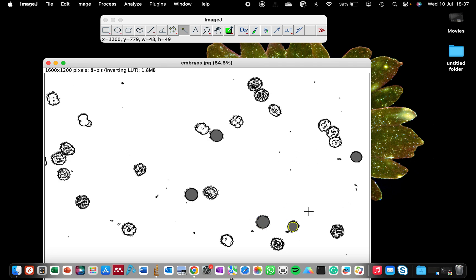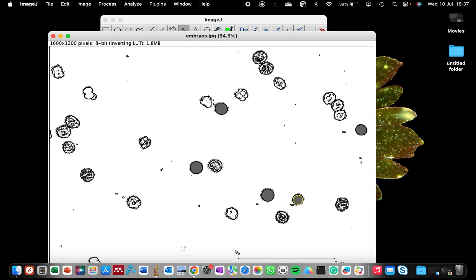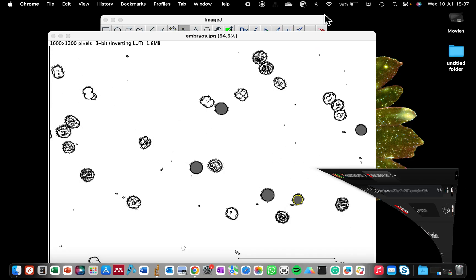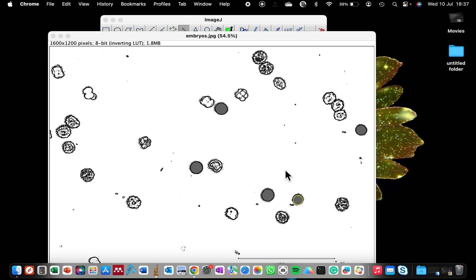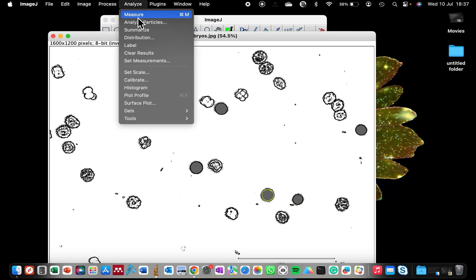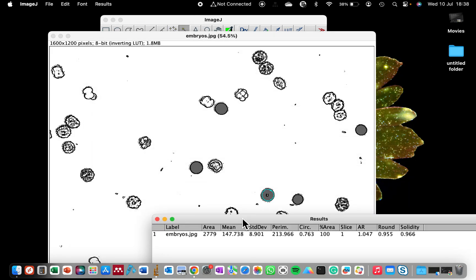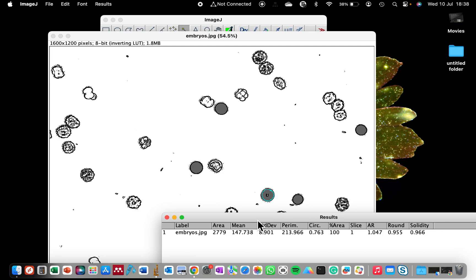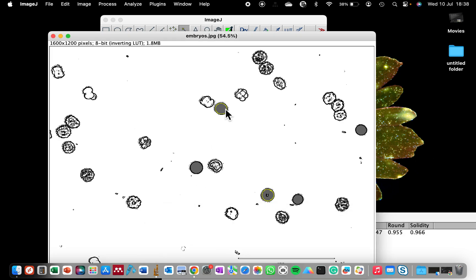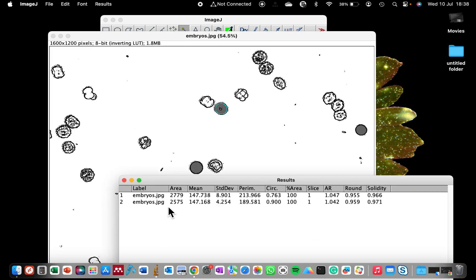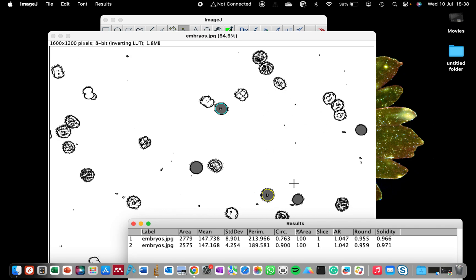Now you can decide to quantify these five cells. I'm going to put the link at the edge of the video on how to do your measurement so as not to make this video too long. You can decide to measure each of these cells alone by clicking on it, go to Analyze, tell it to Measure. And now you have the information about this particular cell. You can see it has colored that particular cell and assigned a number. If I click on another cell and I click on M also, that also has been measured. You can see now number two, the information of cell number two.